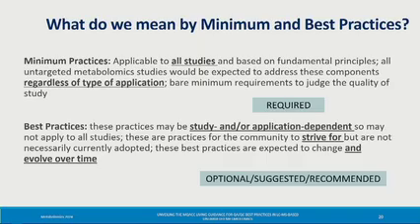On the other hand, the best practices are those that may be study and/or application dependent, so may not apply to all studies. These are practices for the community to strive for, but are not necessarily currently adopted. These best practices are expected to change and evolve over time. The best practices are optional, suggested, or recommended.